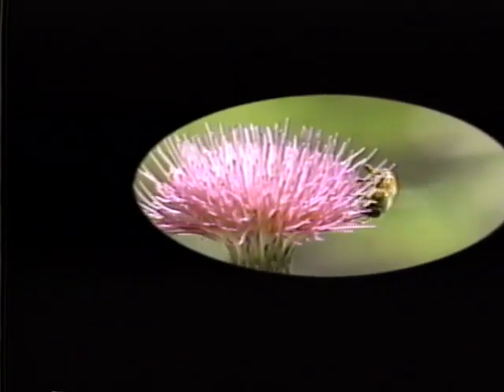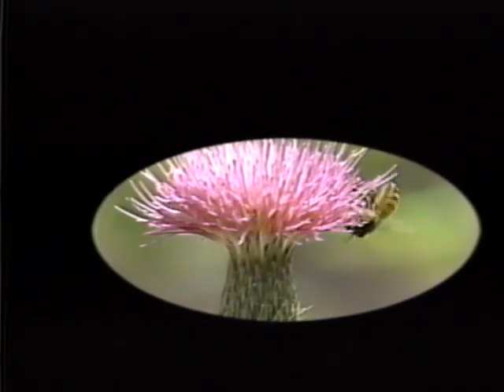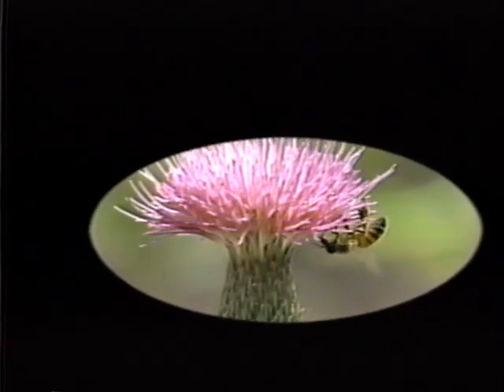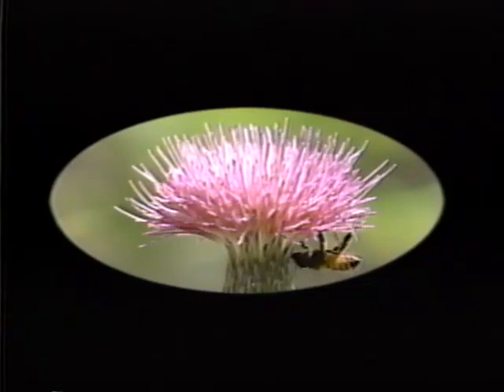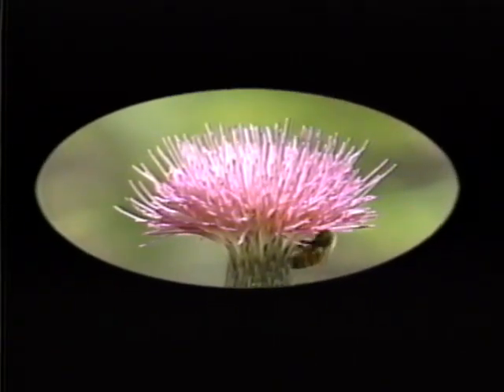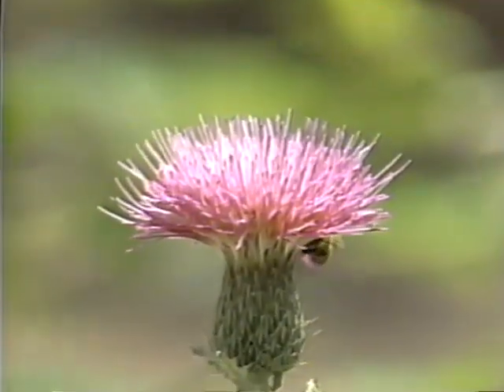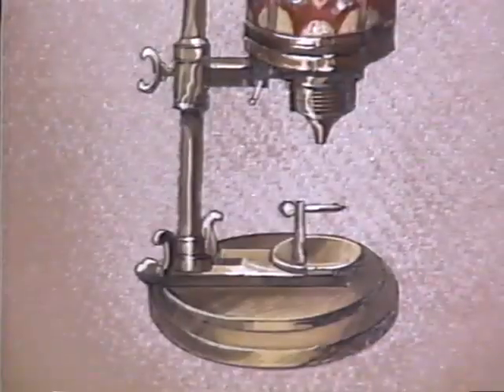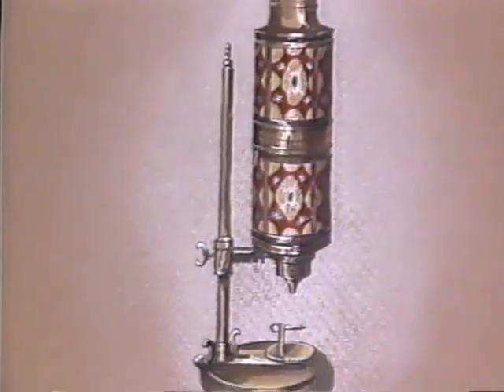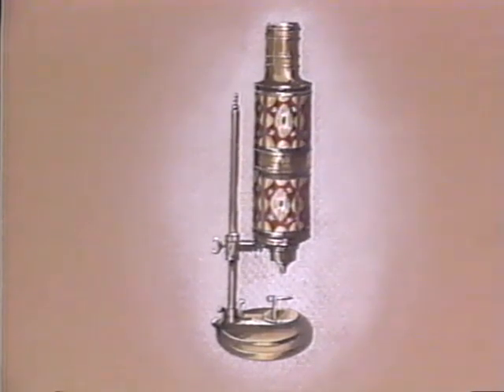Yet with all the information that the eye provides, it can only perceive or see a small part of the real world. There is an entire world of the very small that is completely hidden from view by the unaided eye. For most of history, man was never aware of this world of the very, very small. However, since the creation of the first microscopes in the 1600s, man has attempted to build better and better instruments to discover as much as possible about this hidden world.